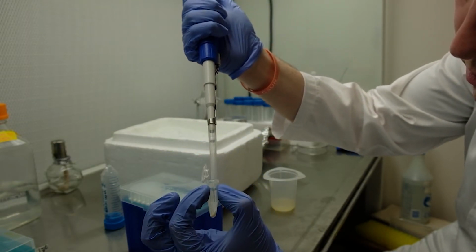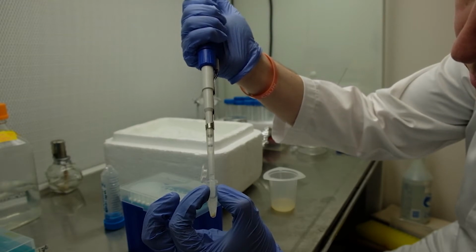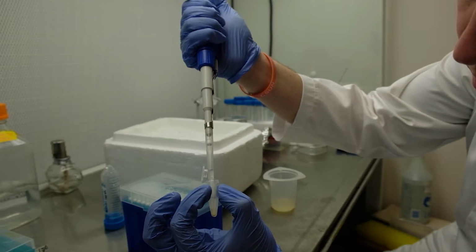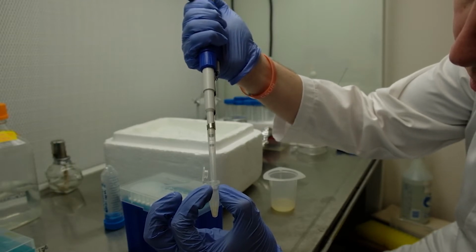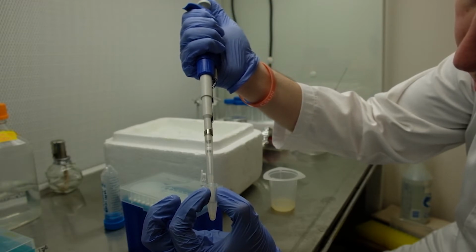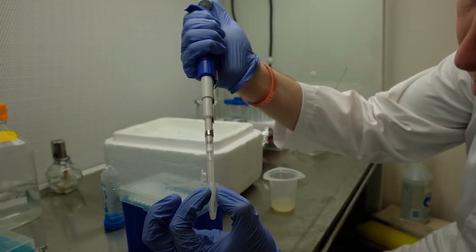Be gentle and move the plunger very slowly. Aspirate and dispense the liquid near the pellet several times to try to break it up. You can try to dispense while the tip is puncturing the pellet. That should break it up from within. Also, slightly swirling the tip inside the tube might help.